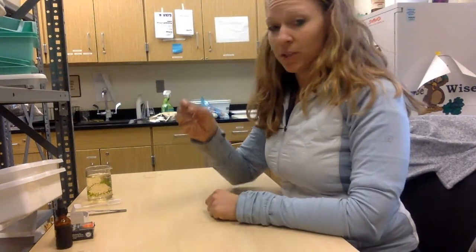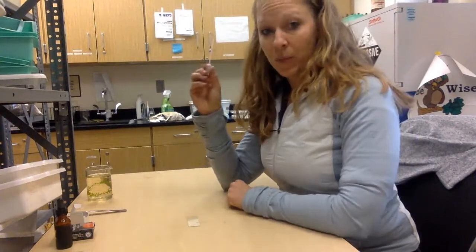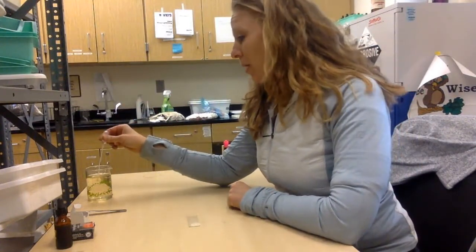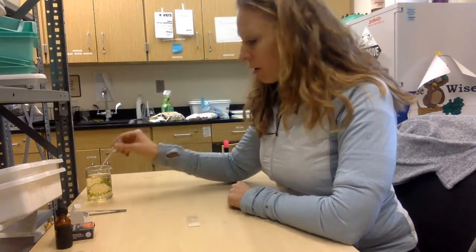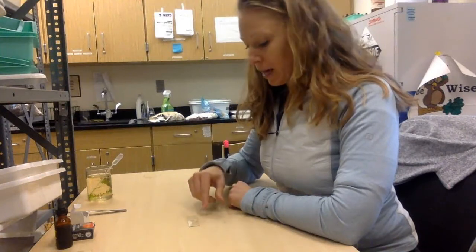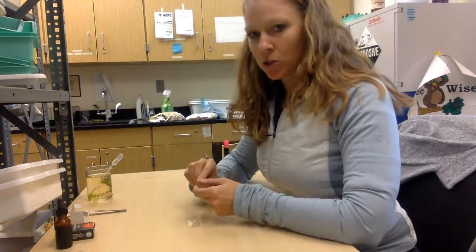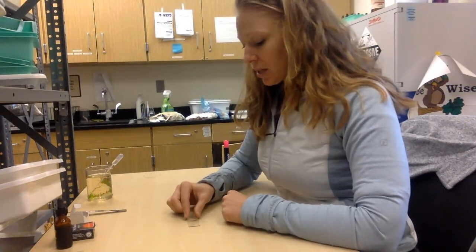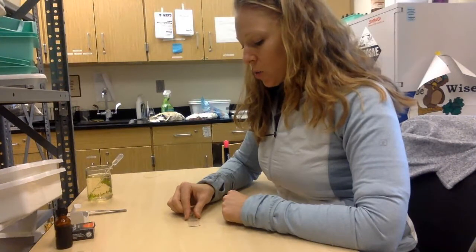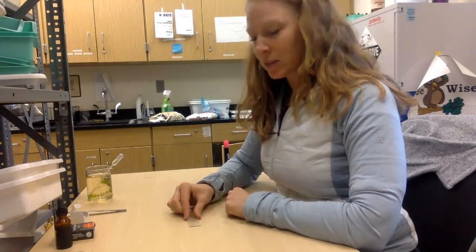So first we're going to start off with a slide, and I'm going to use the pipette and put a few drops or a small puddle on the slide. The amount that you want to shoot for is when you put this cover slip on, you're going to want to be able to move some water underneath, and I'll explain what that means in a little bit.